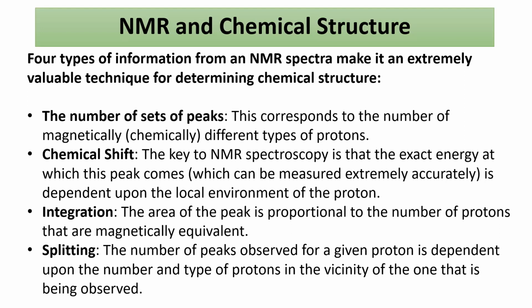Splitting. This is also very important. The splitting tells you the type of proton and how many protons are neighboring that proton. All right, that's it again. The splitting tells you the type of proton or protons that you're dealing with and how many protons are next door. Make sense?